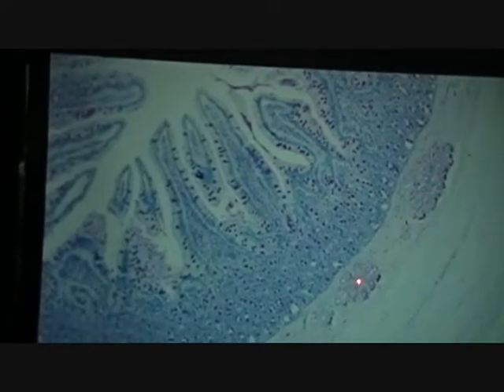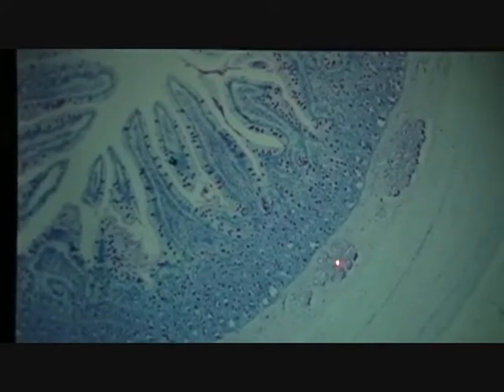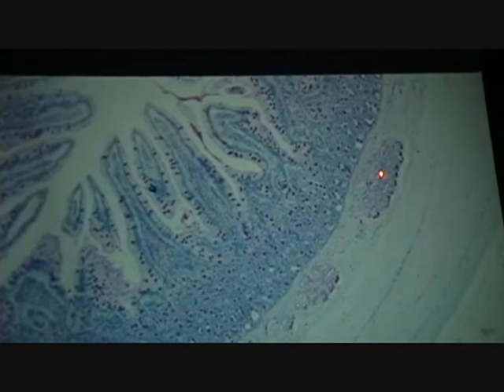Whereas you compare it to these here. See, it's just a little fuzzy, not nearly as intense for the stain. These are mucus cell clusters in the submucosa. You know them better as Brunner's glands, which are just your stock mucus cells, just like salivary. So where is this? Yeah, specifically it's got to be duodenum if you know those are Brunner's glands.